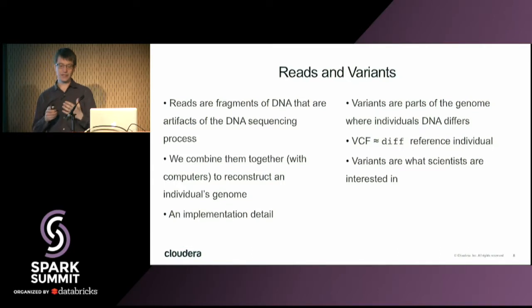So I just mentioned reads. Reads are these little snippets of DNA sequence, and in some sense they're not really a natural thing. They're an artifact of DNA sequencing, because there are chemicals that chop DNA up into little pieces, and then the challenge is to recombine them to reconstruct the genome. So in software engineering parlance, a read is like an implementation detail. It's a way of getting back to the genome. And there are other sequencing technologies that don't have these short reads.